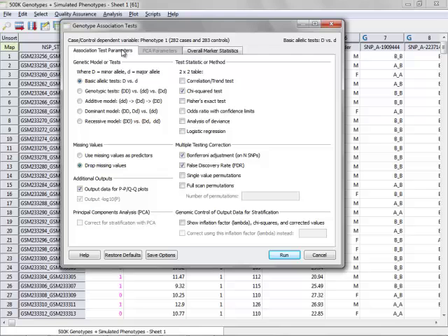For this demonstration, I'm just going to go ahead and choose the basic allele test and the chi-square test statistic and click run.